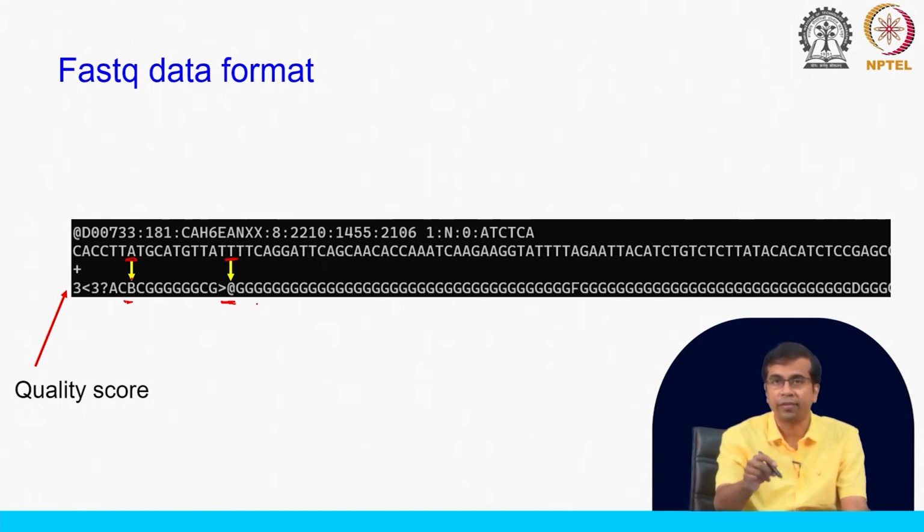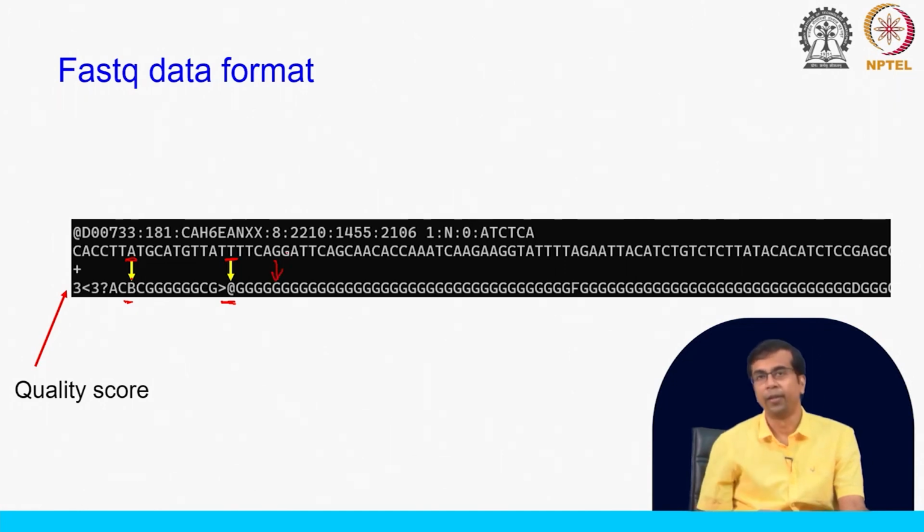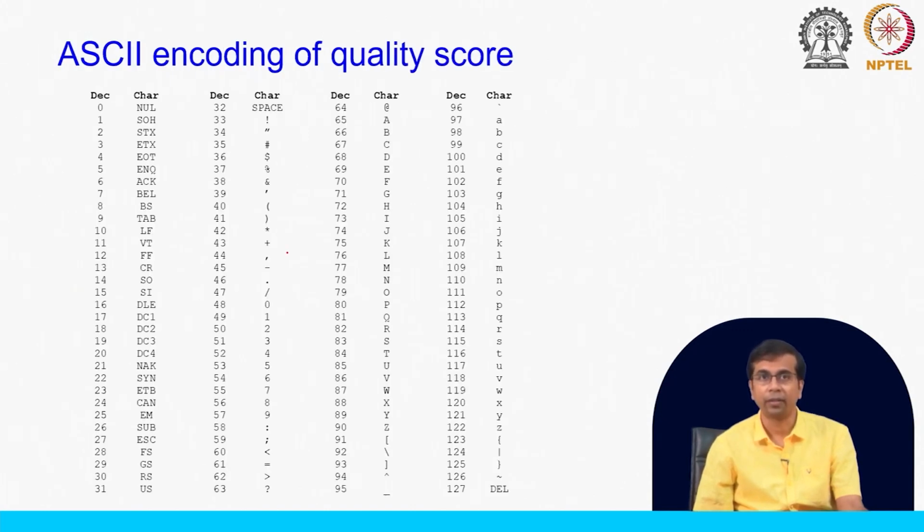So, you have this one-to-one correspondence, right. So, you can just simply read the quality score down here. Okay. So, this is something that is very convenient for the FASTQ format. Now, the question is how are these quality scores represented, right. So, what do these numbers mean? Can we extract this information and correlate this with the probability of error, right, that we have discussed in the last class, right. So, probability of error and the accuracy calculation, can we do that from this?